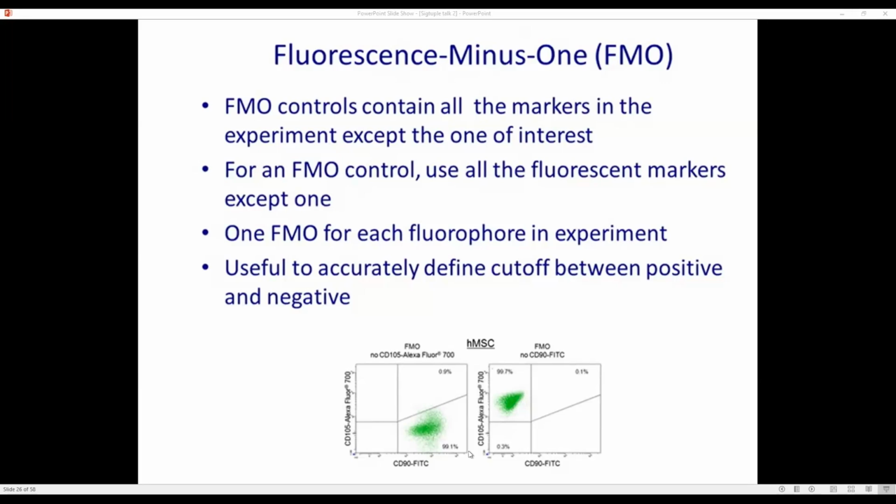I repeat, the two factors you need to consider: first, are you using the same fluorochromes which you used as single stain controls to do compensation? Second, if there is a voltage change, or your machine settings have changed, then you redo the compensation. You cannot use the old compensation matrix. I suppose I answered that.